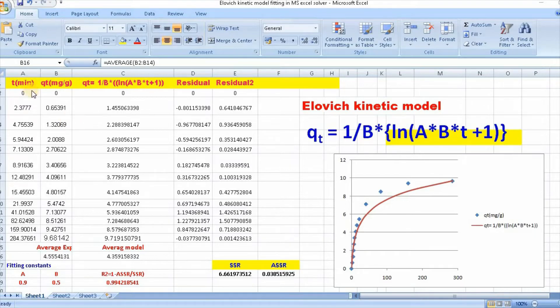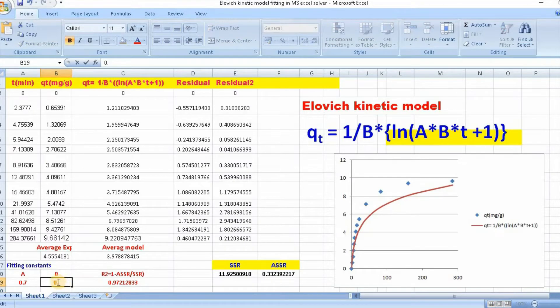In order to fit, I have taken adsorption kinetic data for equilibration time and amount adsorbed at time t. You need to write this function here, equal to 1 by b into ln a b t plus 1. You need to also put fitting constants a and b. Initially, you need to put some value. For example, I put it 7 and then I also put it 4.